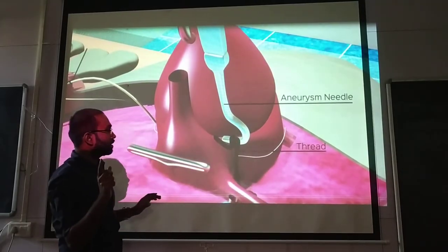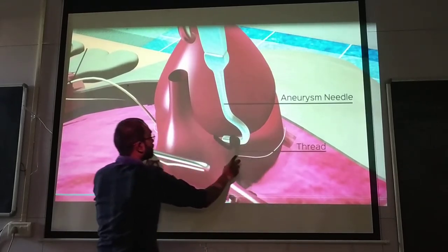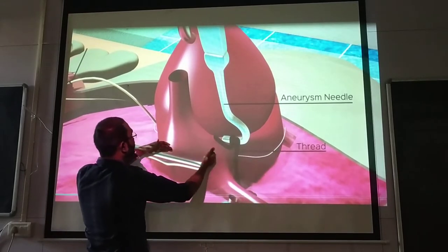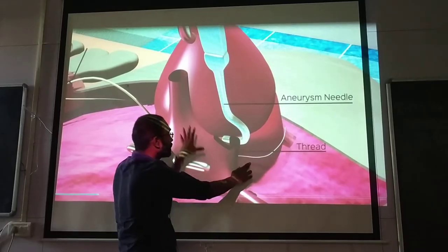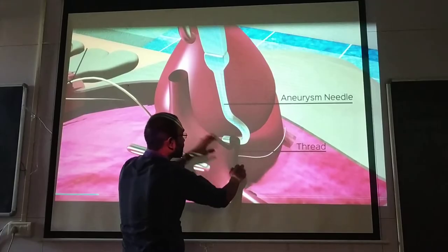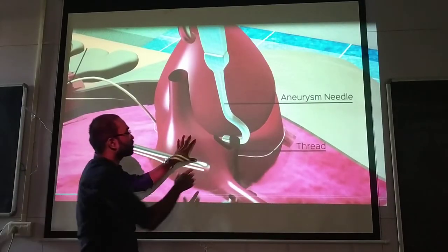The first ligature — the first thread — we will pass and tie here, at the junction between sinus venosus and atria. This is the sinus venosus, this is the atria, and the first thread will be tied here. So the first ligature is at the sinus venosus–atria junction.